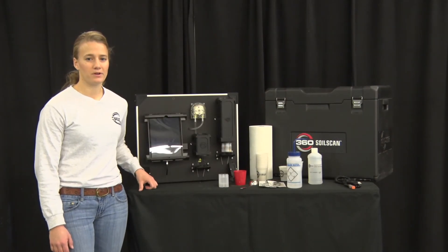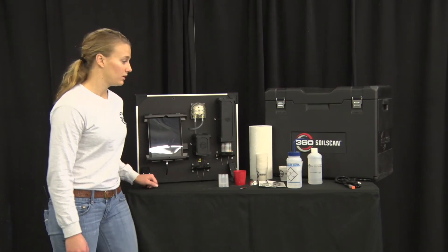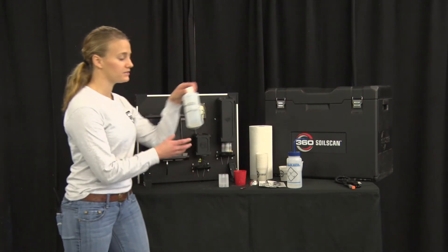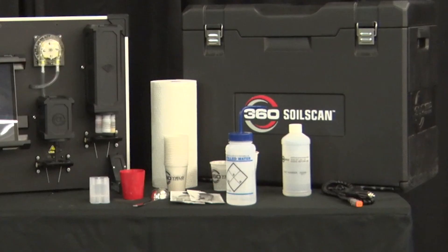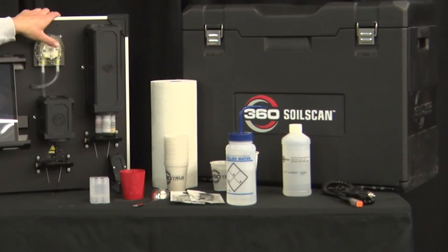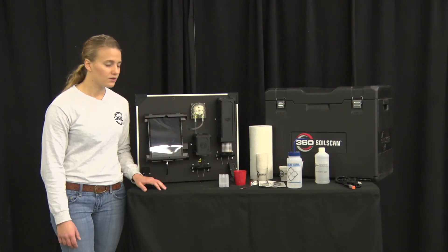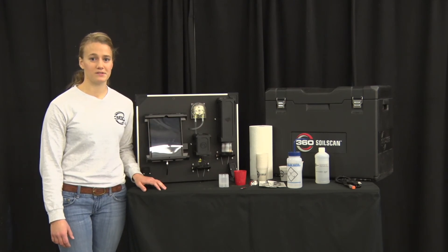Parts you'll want to replace every year are the gray nitrate sensor and the red reference tip, and you'll also want to get new nitrate solution every year. Other replaceable components include the motor, the pump, and any of the tools on the table including the power cables — those will only need to be replaced as needed.